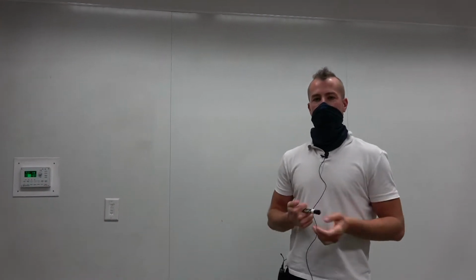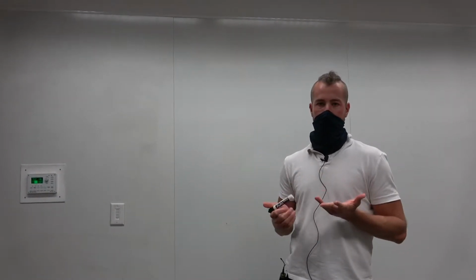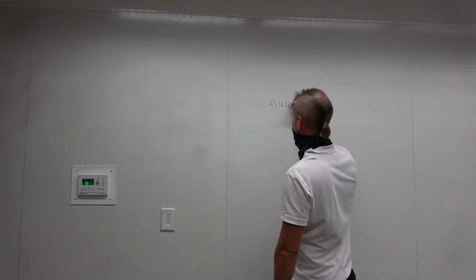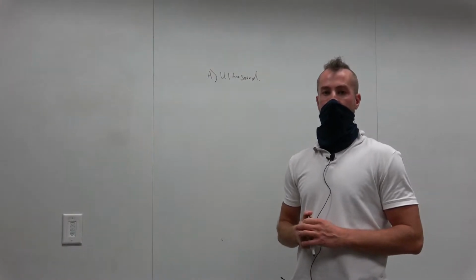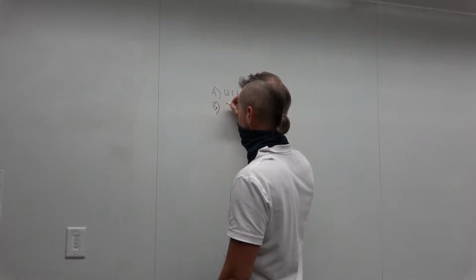Okay, well, welcome to day 2. And if you read through the protocol, day 2 and day 3 are kind of lumped together. So there's kind of 3 big things that you're doing. One is the ultrasound, and that's the actual imaging of the particles that you made in day 1. The second 2 are characterization steps.